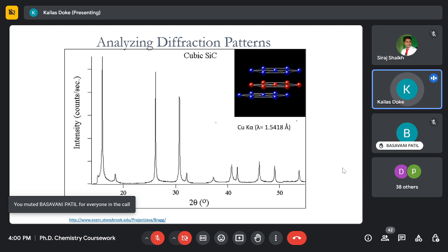The most intense peak indicates that, wait some time. This one is the most intense peak, where in one plane there are 5 different constituent atoms, in the second plane 5 different constituent atoms, in the third plane 5 different constituent atoms. But if the number of constituent atoms, ions or particles is more, the population is more, the intensity is more. That is a rule of spectroscopy that is known to everyone. Okay?